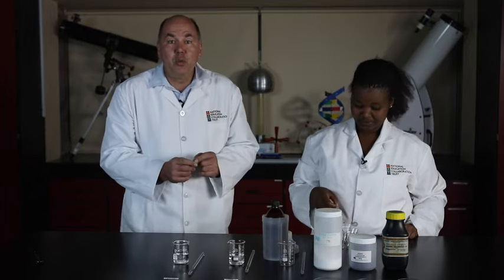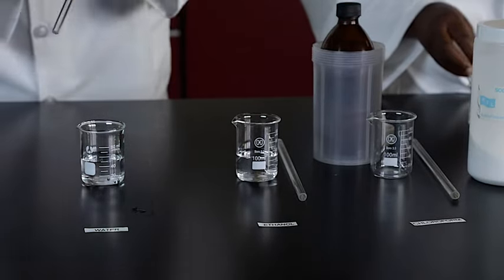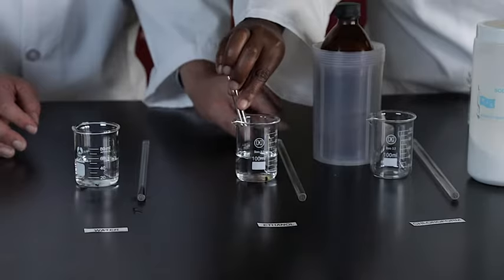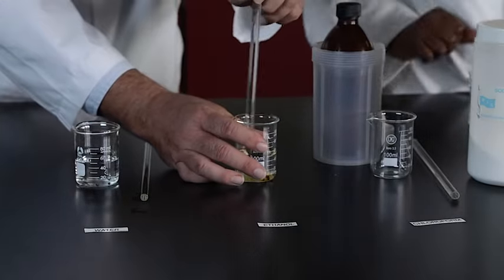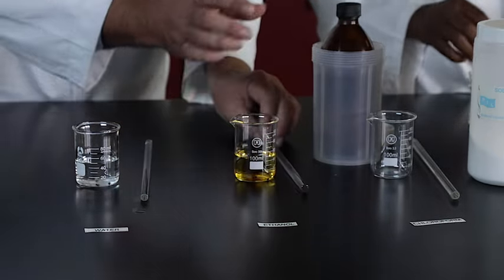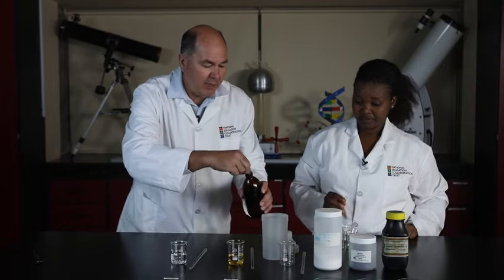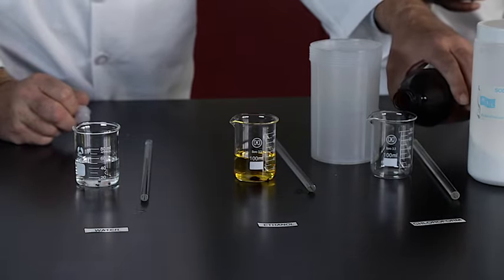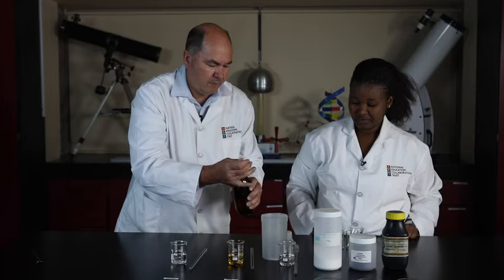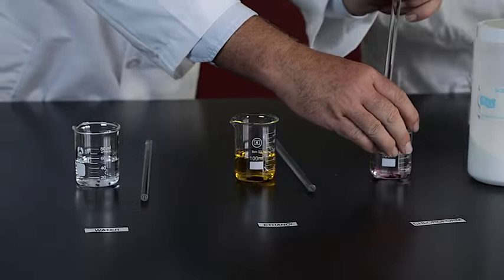Add the iodine to water and stir 4 times, and we'll let it stand for a few minutes. We'll do the same for the ethanol. And finally, we're going to add chloroform to the beaker, and at the same time, we'll add the iodine. And give it a stir.